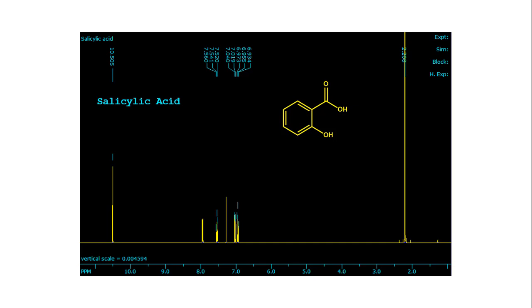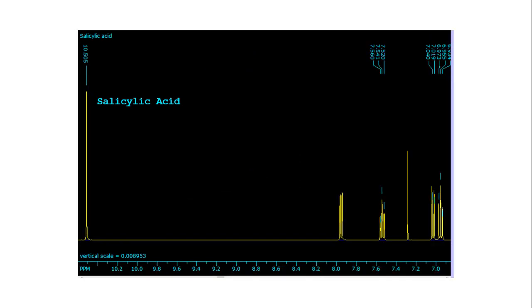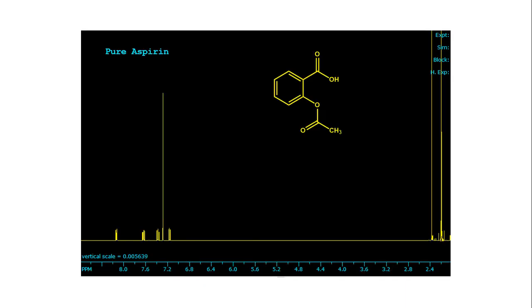Here is salicylic acid by itself. At about 10.5 ppm you see the carboxylic acid proton; the OH is not showing up, but the aromatic protons are definitely showing up between seven and eight ppm. The acetone peak at 2.2 can be disregarded. Here is a zoom of the aromatic section. And then this is the pure aspirin — you see the aromatics, and for some reason the carboxylic acid proton doesn't show up in the pure sample, though it is still there.